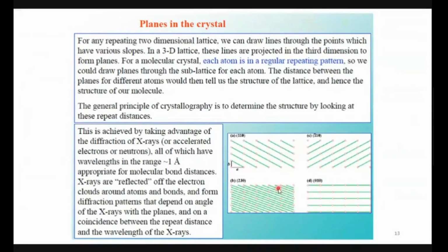The crystal structure is the same. Okay, now imagine we are seeing only one layer of the entire crystal, the layer which is facing the observer. There will be layers behind this layer also. If you join all those layers, you will get planes instead of lines.